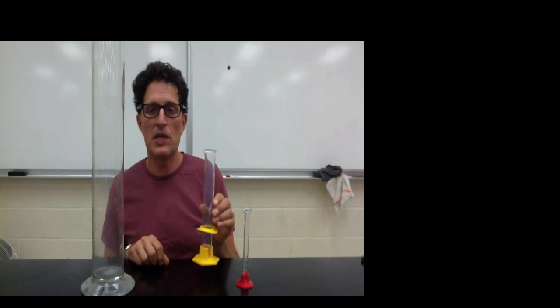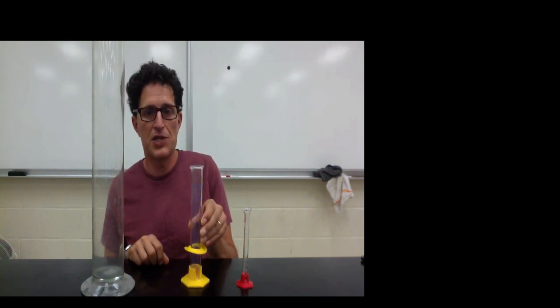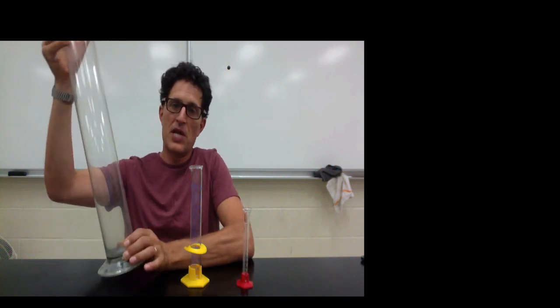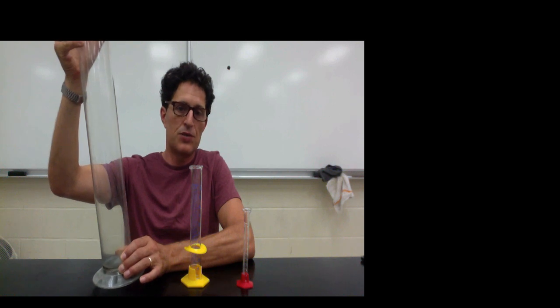I have a 100 milliliter graduated cylinder which measures to 1 milliliter of precision and this baby over here is a 2 liter graduated cylinder that measures to 20 milliliters of precision.